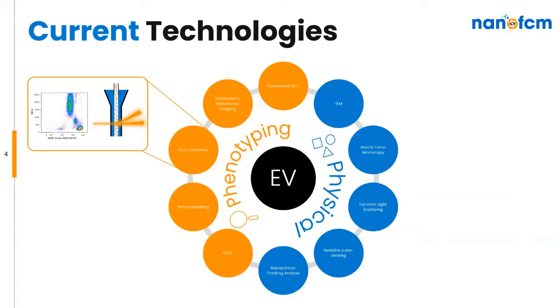Flow cytometry holds a huge amount of potential for EV characterization. However, again, conventional cytometers lack the resolution and sensitivity needed for nanoparticle analysis.